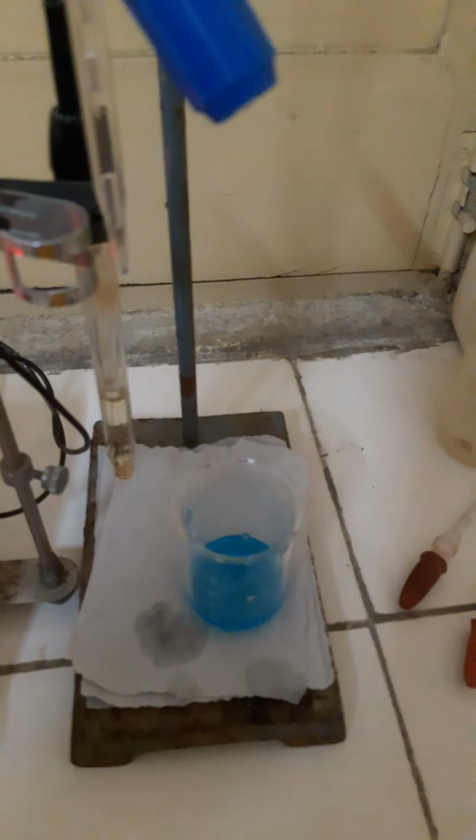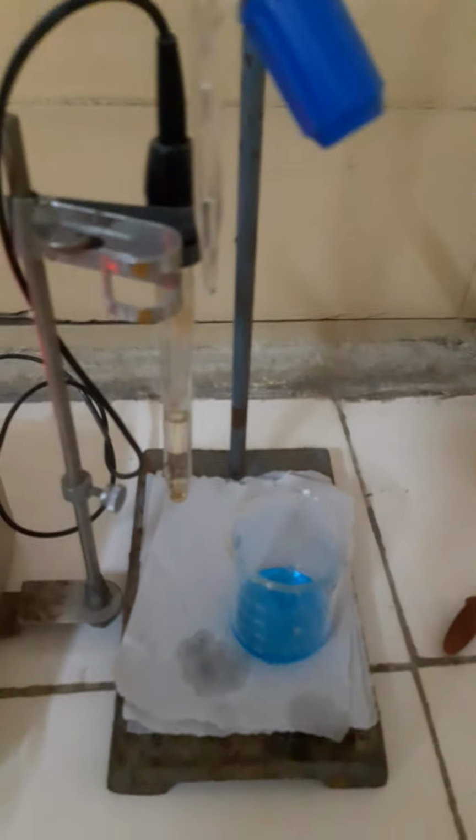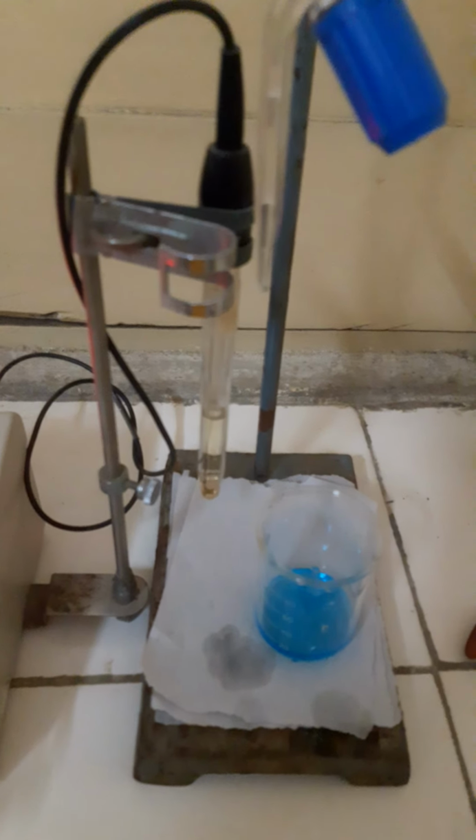Now similarly you have to take this out. Similarly, you have to go for the calculation for the complex. In a beaker, this is the complex consisting of glycine as well as cupric chloride. For this, you have to take 250 mg of the glycine and 160 mg of cupric chloride. You have to mix in 100 ml of water. From this, you have to take 75 ml.